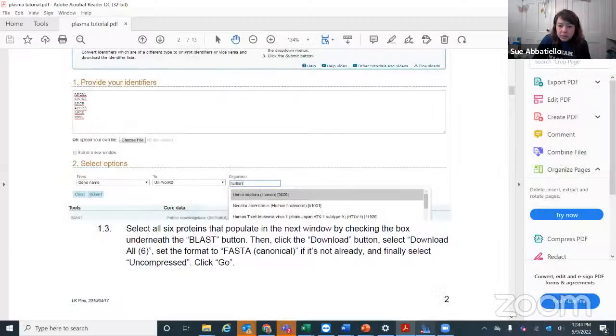That's also one of the reasons we don't normally like to use these small Y or small B ions, because they come from two amino acids. And if it's the Ys, we know that 50%-ish of the peptides have a lysine and 50% have an arginine, so it's easy to miss a signal based on that. Usually the way I like to look at it, I'll just share my screen real quick and look at the Skyline file.